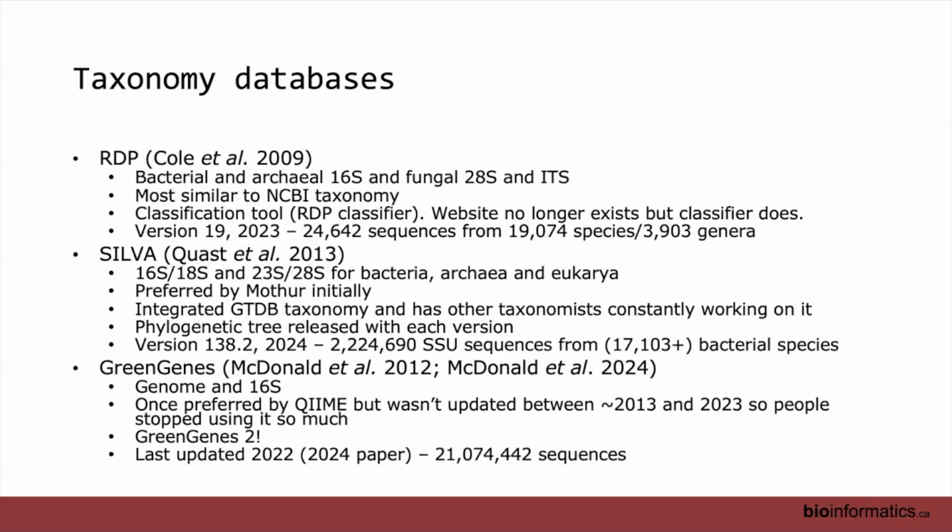So, many different taxonomic databases. RDP was probably one of the first ones. This stands for Ribosomal Database Project. It includes bacterial and archaeal 16S and fungal 28S, as well as ITS. They most closely follow the NCBI taxonomy.